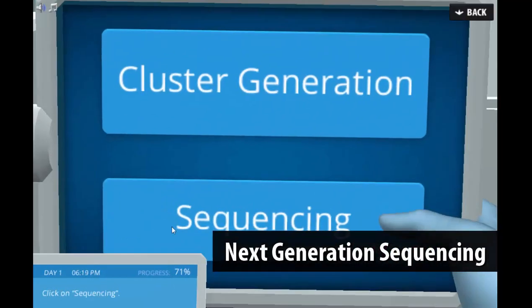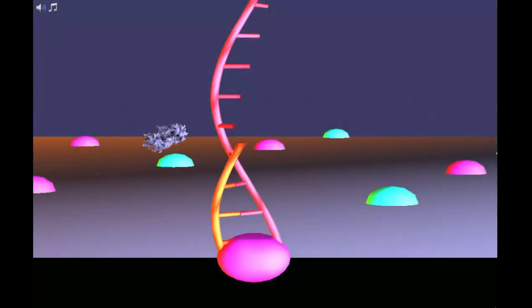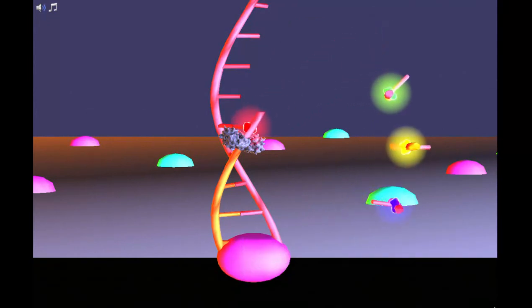Students will perform an NGS experiment and learn all the important steps in this high-tech molecular biology procedure with immersive 3D animations that show what is happening at the molecular level inside the NGS machine.